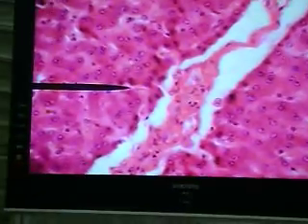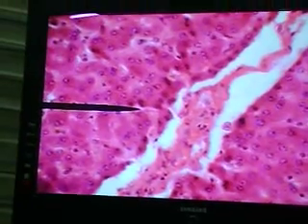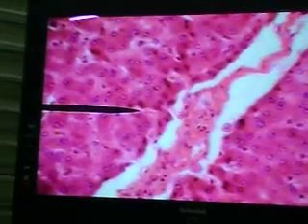Another Kupffer cell with some cytoplasmic processes. Very good. So anyway, where are we? So you find now that the osmic acid binds with the cell membrane, with the plasma lemma. Okay? Because the cell membrane is primarily the lipid layer in it, the osmic acid will bind.